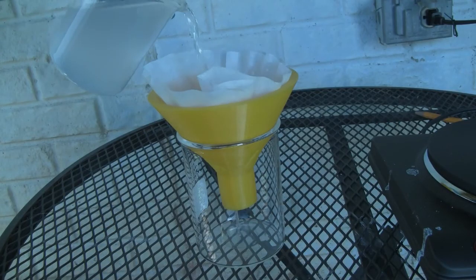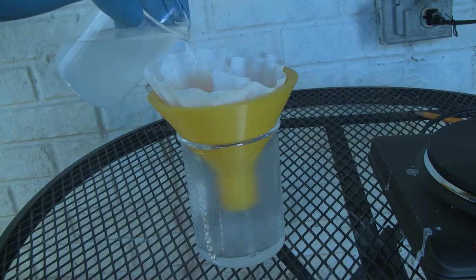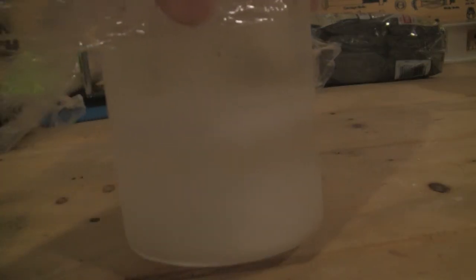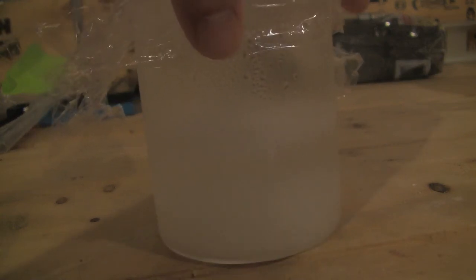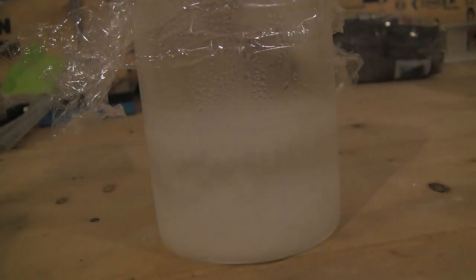After a couple minutes of boiling, the solution was then removed from heat and then gravity filtered to remove any undissolved impurities. The solution was then cooled to room temperature, which allowed white needle-like crystals to form on the top and bottom of the solution. Once at room temperature, the top of the beaker was covered with plastic wrap and put into the fridge for about an hour to squeeze out a little more ASA from the solution.